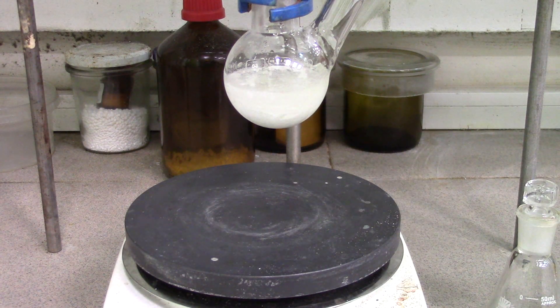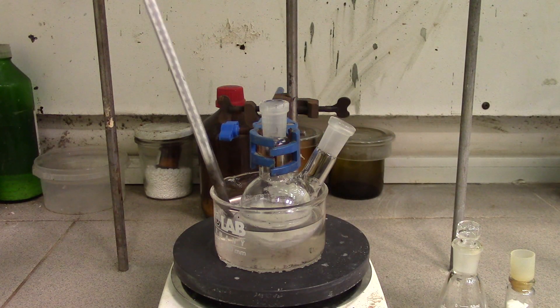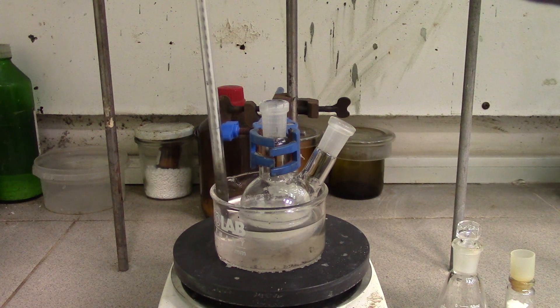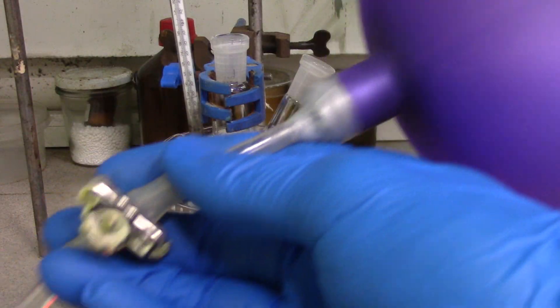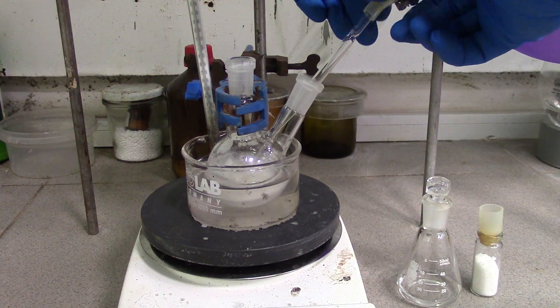Thereafter, I put the whole construction into a silicon oil bath for even heating. Of course, controlling temperature. Now it needs to be aerated by argon or nitrogen with vigorous stirring during 30 minutes at 60 degrees C.